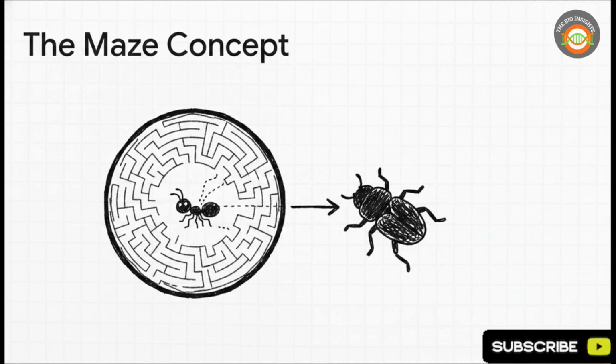But the small molecules, our ants, wander into this incredibly intricate maze of pores inside every single bead. Because they're taking this massive detour, they are delayed and elute much later. This trick perfectly separates a sample strictly by decreasing molecular weight.